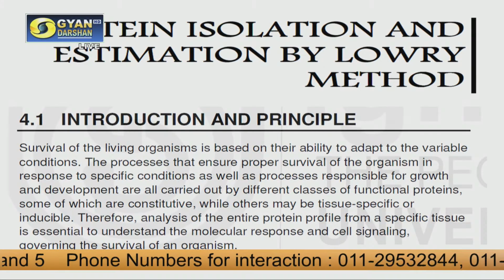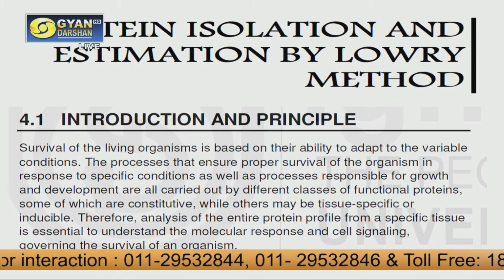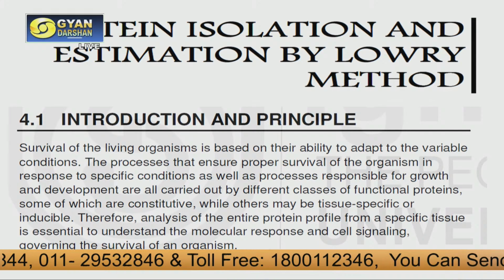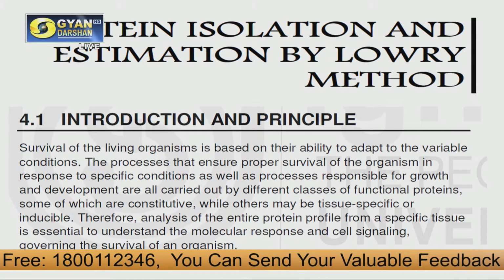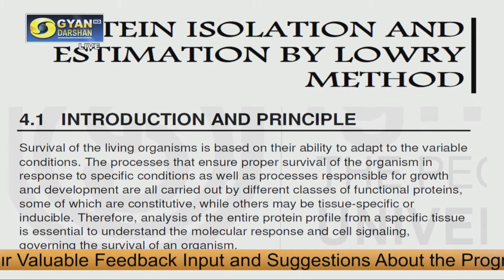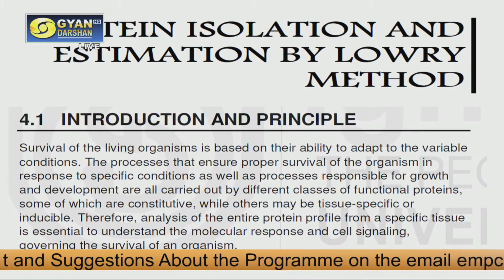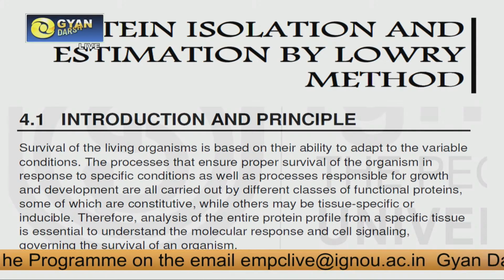Now, once we know how to isolate DNA, we should also know how to isolate a protein and how to estimate the protein content. Qualitative and quantitative. So today's second part of the discussion, the next 2 experiments, these will focus on protein isolation and qualitative and quantitative detection of the protein quality. That means the quality of the protein is being checked and the quantity of the protein is being measured.